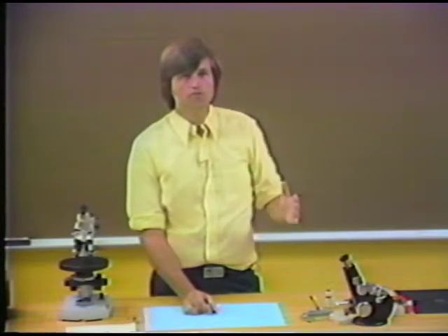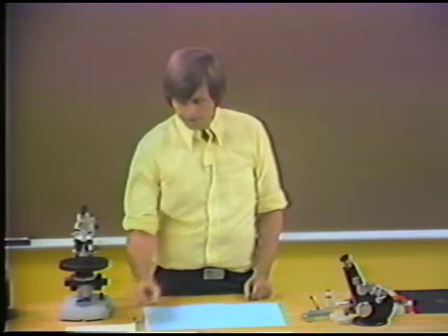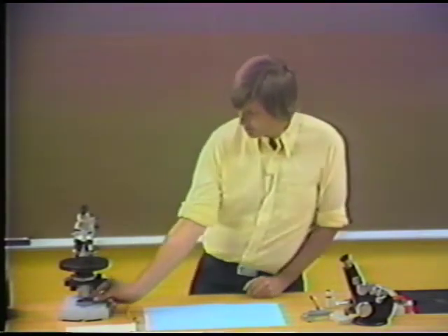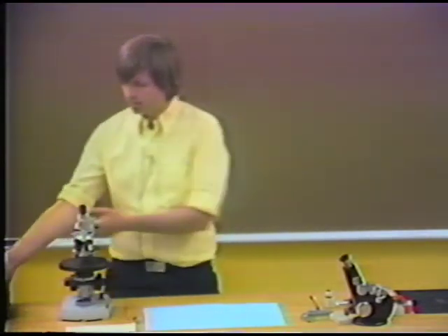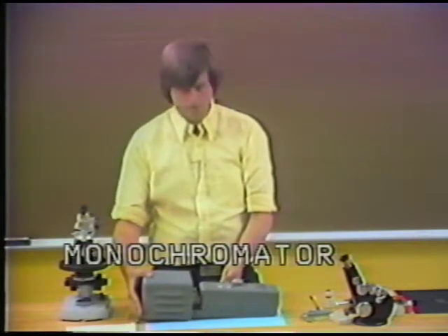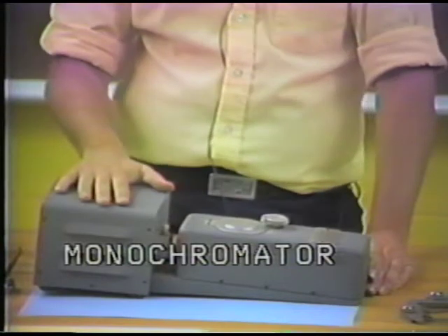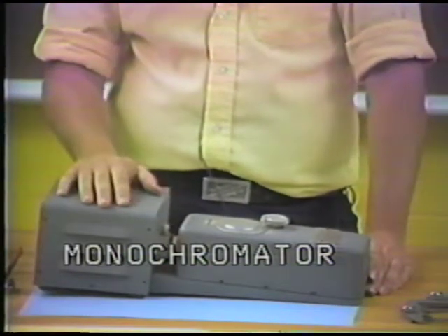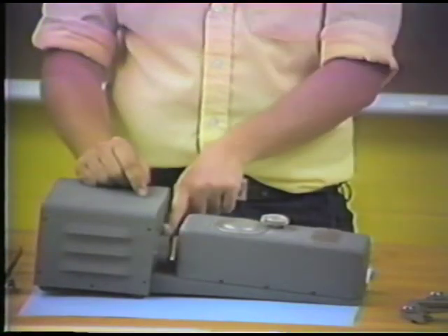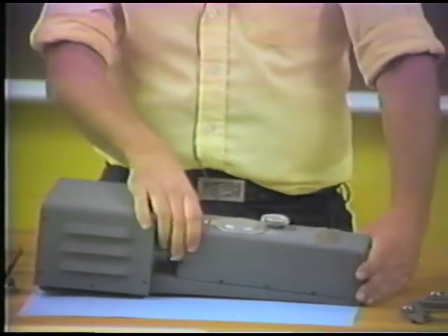Typically now when we're looking at specimens, we use white light, and we use this blue filter to help us. This white light is, of course, light of a whole variety of wavelengths. But there are some times when, using the petrographic microscope, we need to look at light of only one wavelength. And in order to do this, we use a device called a monochromator. I have a monochromator here. It's actually a very simple device. It starts again with a bulb, which is located here on this side of the instrument, and there's an opening coming from the bulb which shines a directed beam of light into this part of the instrument.